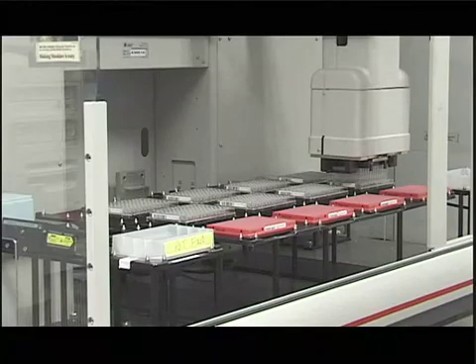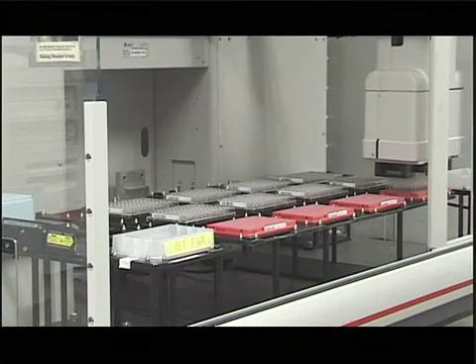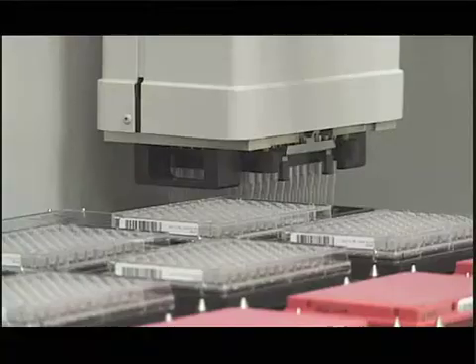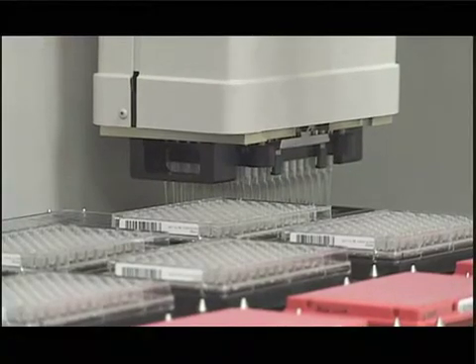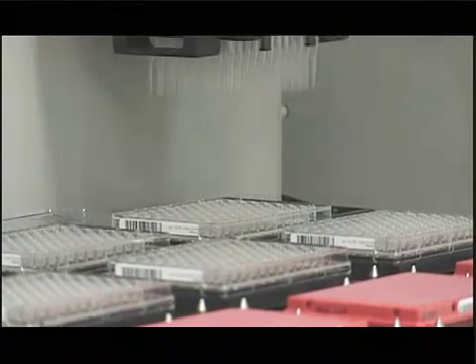Another robot? Yes. This robot transfers the clean DNA from the wells into a 384-well plate containing a PCR reaction mix, including a small amount of each DNA base with different fluorescent dyes attached.